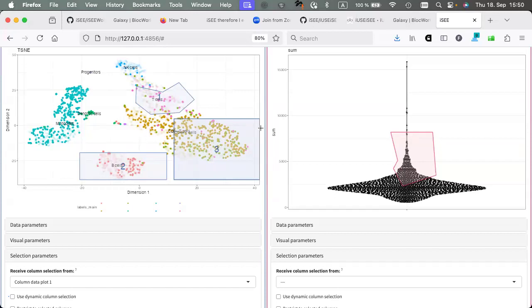You can design your own panels, right? So the interface, iSEE, we are currently at iSEE version 2, and the big step between version 1 and 2 is that we opened it up, just like Cytoscape has plugins. iSEE now has about a dozen extension packages. iSEE itself provides what we call the core packages, the reduced dimension, the column data, and so on. The extension packages provide the volcano plots, the FGSEA plots. So you can basically plot whatever you want if you invest the time to actually implement the panel. Or if you beg hard enough with us.